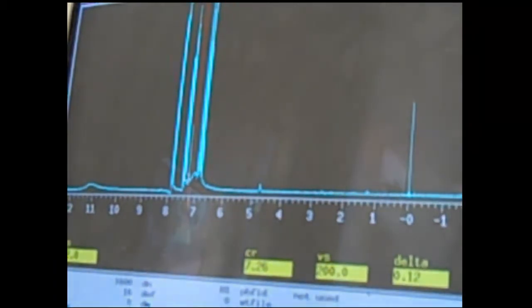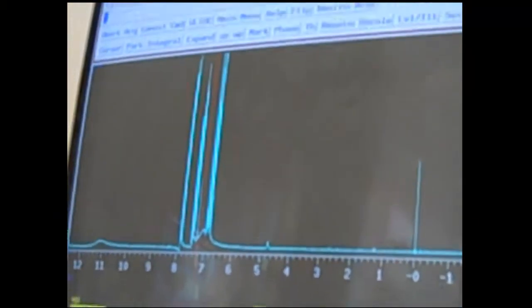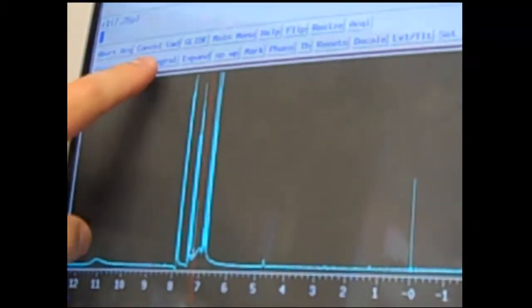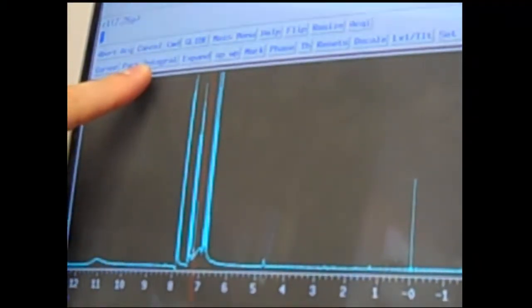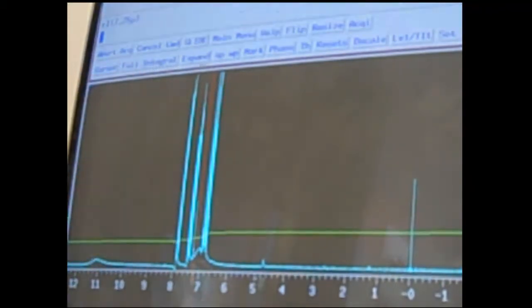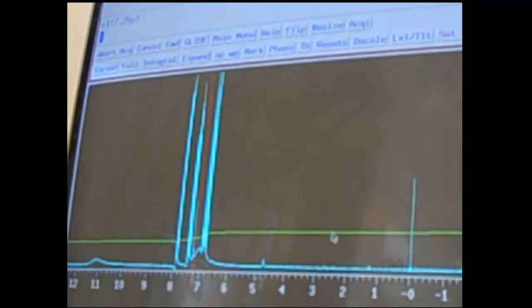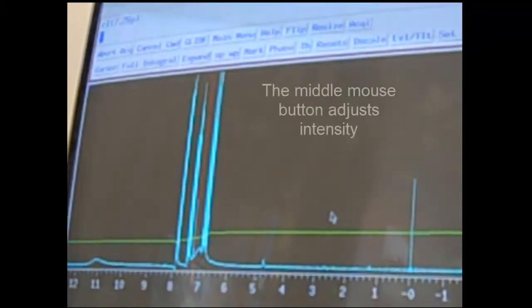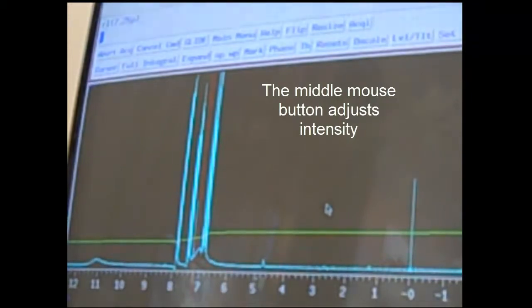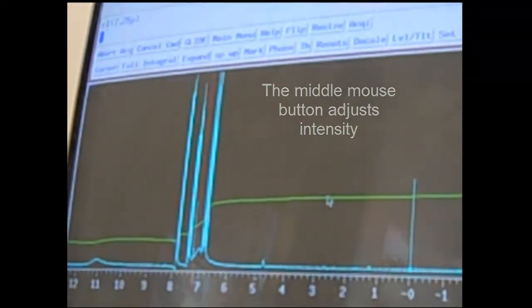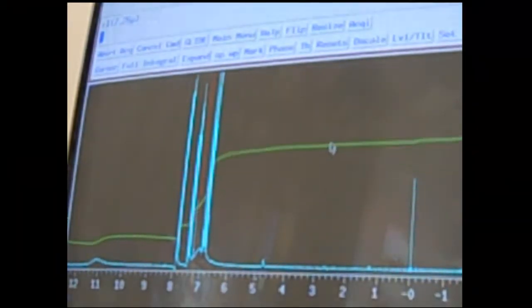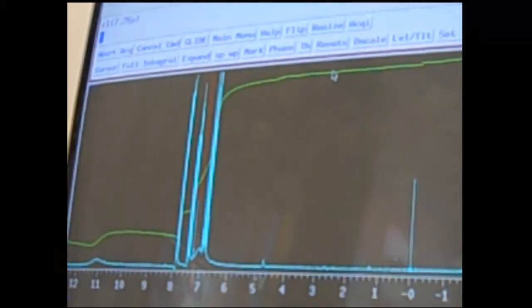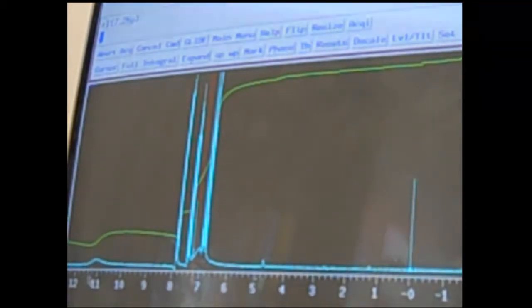At this point you're going to start the integration of the peaks. There will be a button that starts at partial integral. You'll click that until it shows full integral, and notice this green line. Any time you want to adjust the height of something, whether it's the peaks themselves or the integration line, you'll use the middle mouse button, and then click and drag that up to the level you want it.